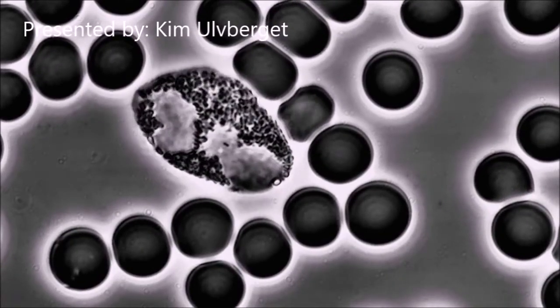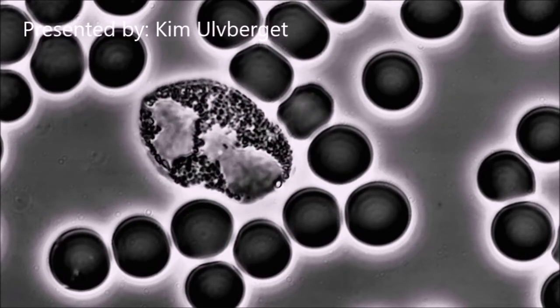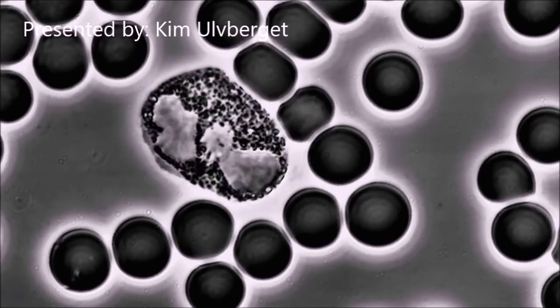Blood cells that stick together or have pointy edges or other abnormal shapes and sizes show signs of blood that has problems.